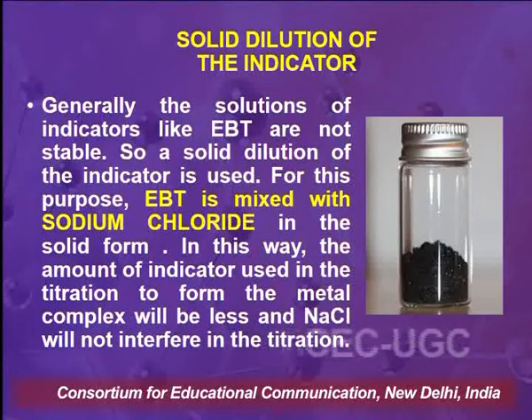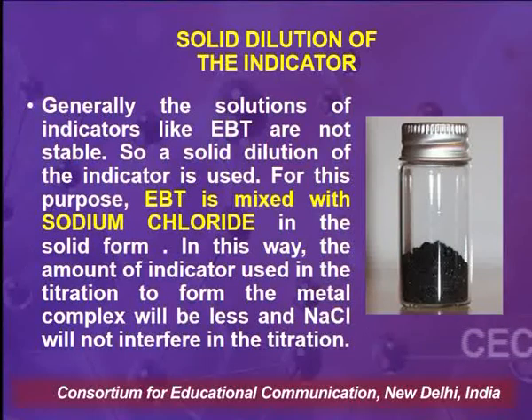In this way, the amount of indicator used in the titration to form the metal complex will be less, and sodium chloride will not interfere in the titration.